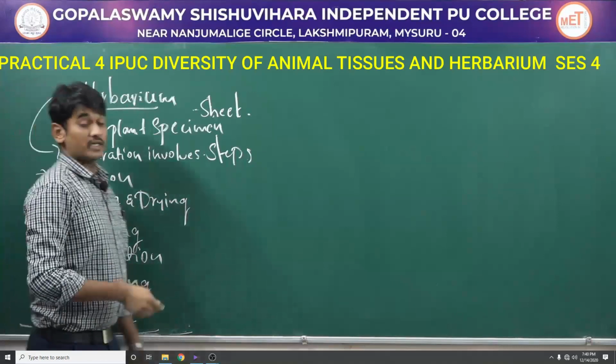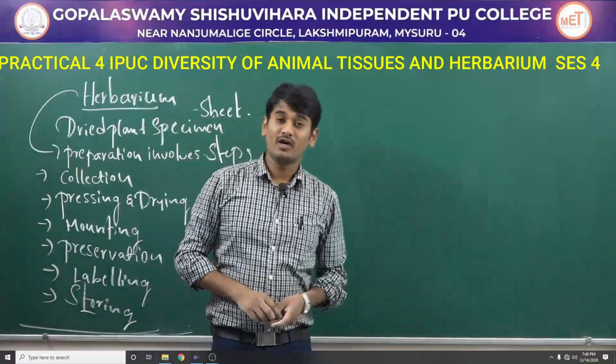Yes, these are all the steps involved in preparation of herbarium.